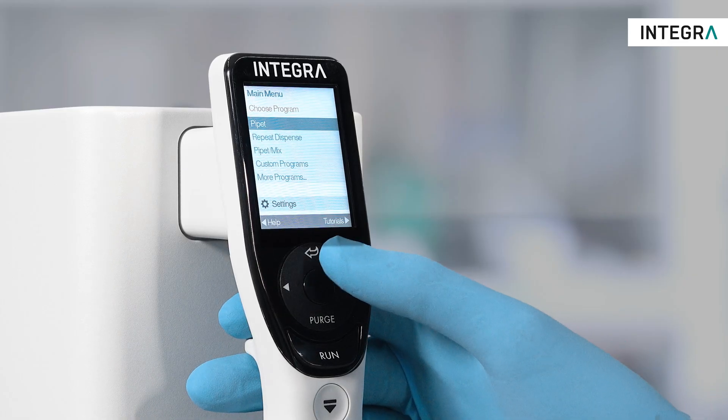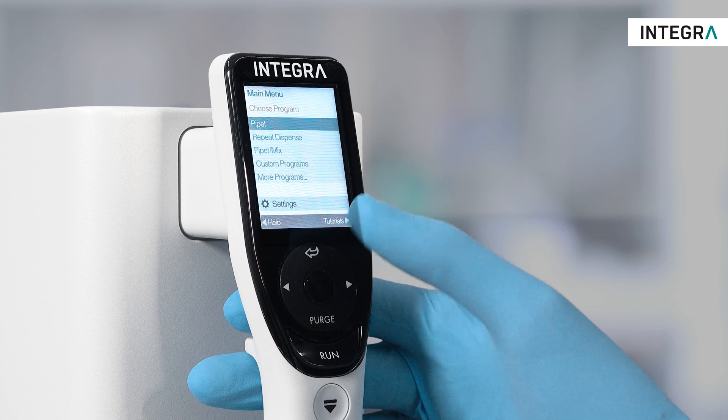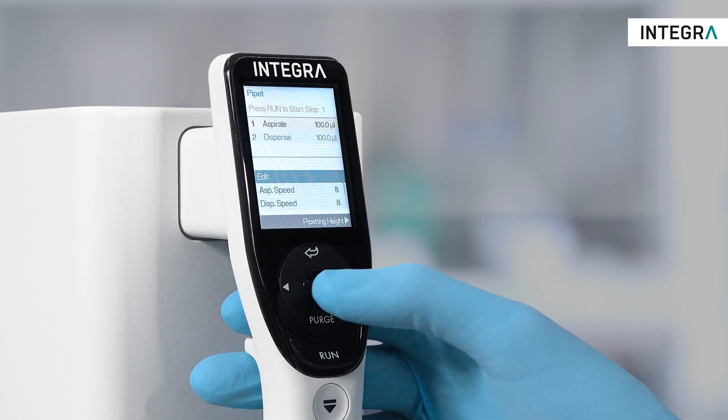Choose a predefined standard program, edit the parameters, and start pipetting by pressing run.